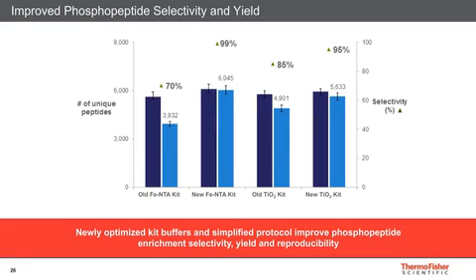Unfortunately, phosphate groups are not the only negatively charged functional groups found on peptides, so there can be significant nonspecific binding of unmodified peptides to these affinity resins. Specifically, carboxylic acid groups found on acidic amino acids and the peptide C-termini can compete for binding, reducing the specificity and the enrichment yield. This is especially true for titanium dioxide resins, which typically require a blocking buffer containing lactic acid or other organic acid to reduce nonspecific binding.